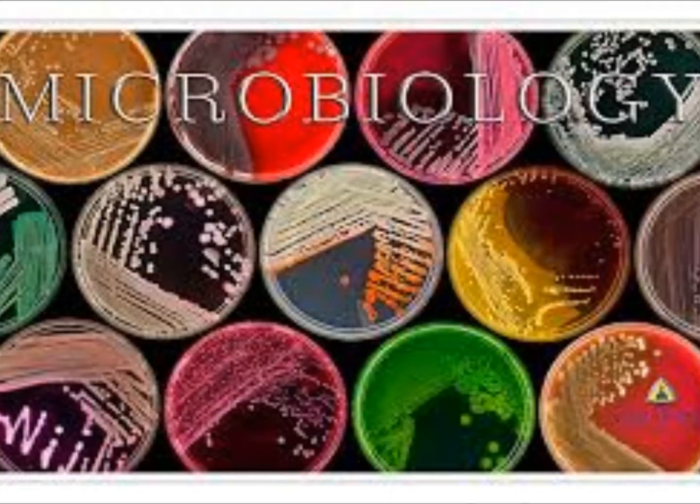And then we have gamma hemolysis. Gamma hemolysis means that there is no hemolysis at all. The organism does not contain the enzymes that help it to lyse the blood cells. And so our gamma hemolysis is pictured here, and you can see that it has not changed the agar whatsoever. And up here, the agar has not changed. There's no greening or no clearing. And so that's what we're looking at, not the colony itself. We're looking at the agar to see if any hemolysis has occurred around the colony within the agar.